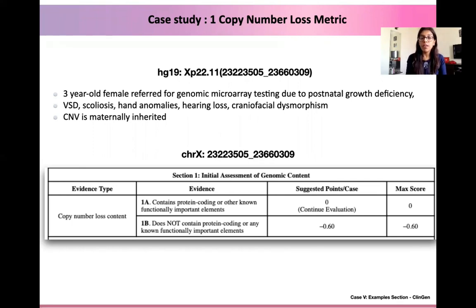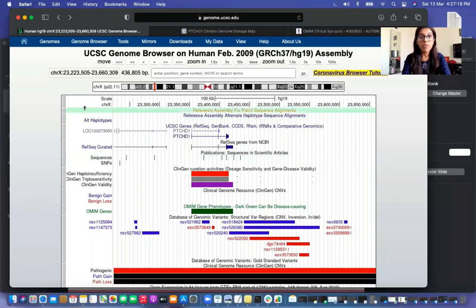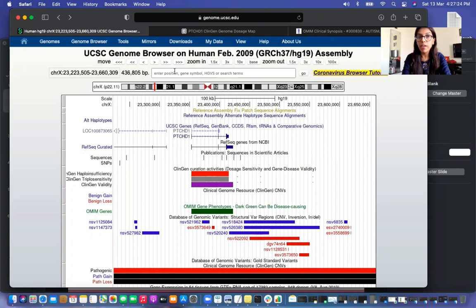To do this, we will take our chromosome X coordinates and go to the UCSC web browser. In the search tab, we enter the chromosome X followed by a colon and the coordinates of interest. When we click on go, we will see a screen with the results.